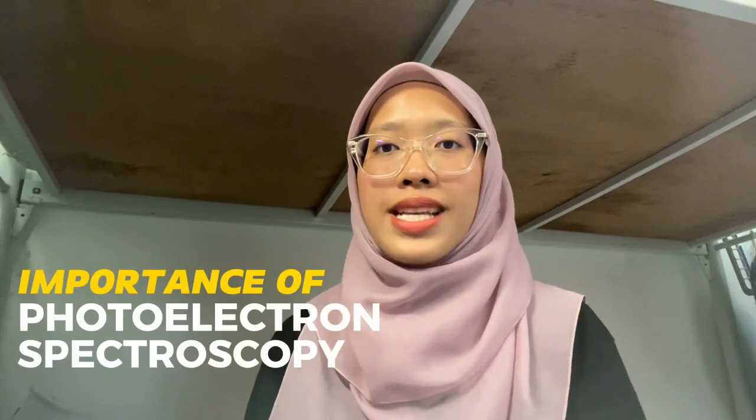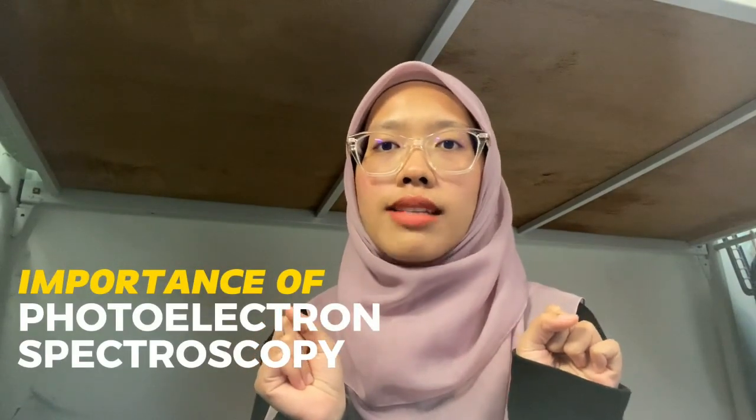Photoelectron spectroscopy is incredibly important because it helps scientists explore the properties of different kinds of matter such as solid, gas, and liquid. It does this by measuring the energy levels of electrons in their orbits around the atoms.